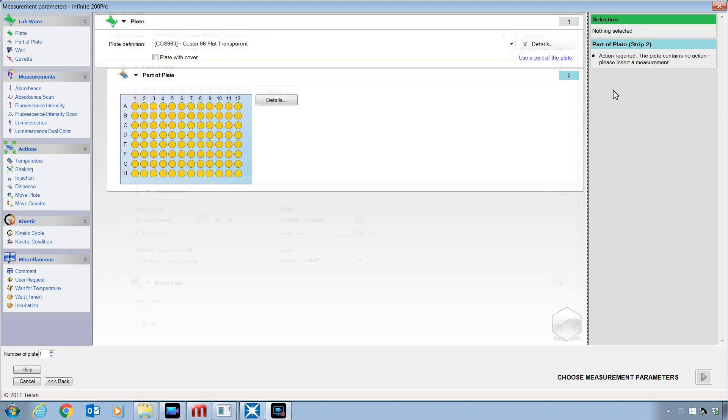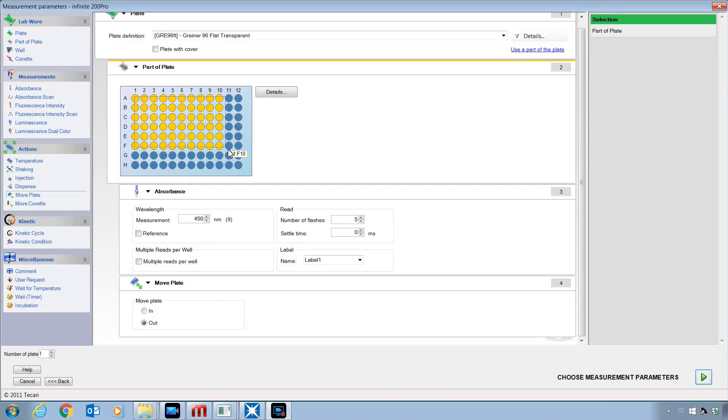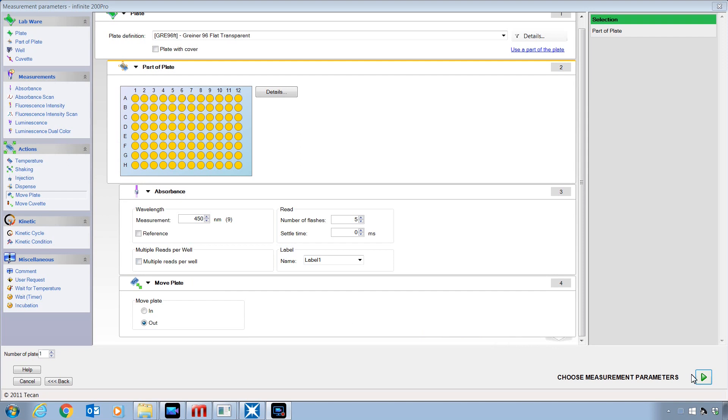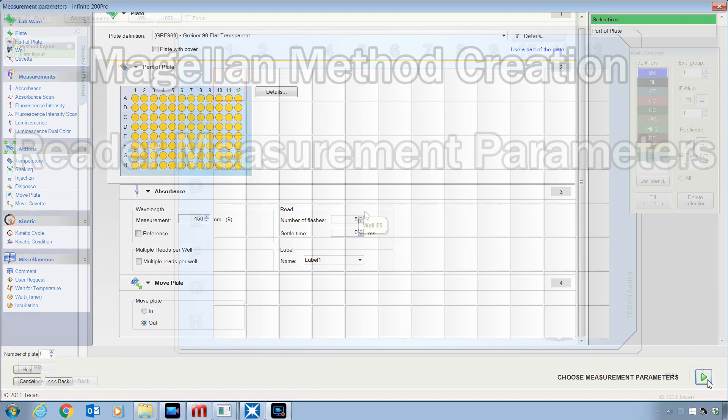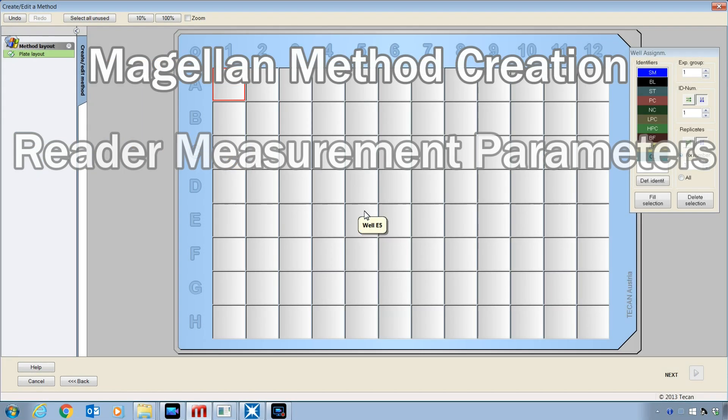That will be covered in a separate video. For this example, the instrument will measure a 96-well plate using absorbance at 450 nm. In the bottom right corner, select Choose Measurement Parameters.